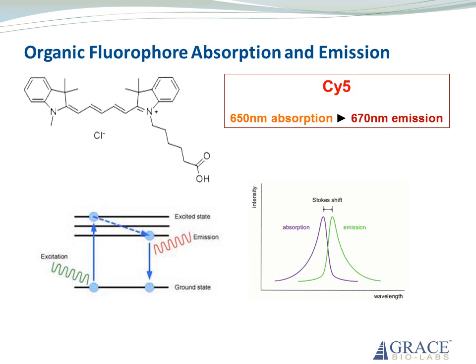Fluorophores are efficient emitters because they are organic molecules containing double bonds that absorb visible light, give off part of the energy in the form of heat, and re-emit a Stokes-shifted photon. Thus, the absorption band and emission band are separated by a very small difference in wavelength domain.